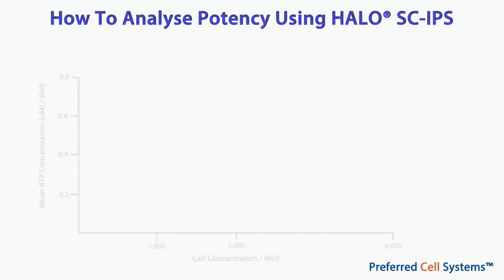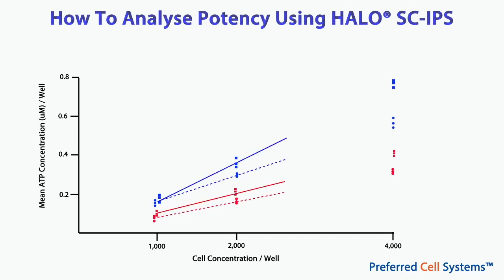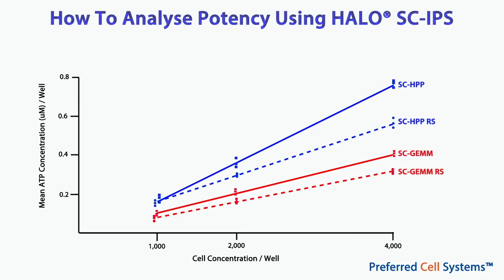The form of the results will be similar to that described in the section on multiple point determinations, so we're repeating a little of this. First, plot the 3-point dose-response curves for each of the 2 stem cell populations and their reference standards. Next, fit each of the 3-point dose-response curves to a linear regression. If your instrument software does this for you, great. If not, you can use Excel, GraphPad Prism, or any other statistical software package that gives you the regression parameters.